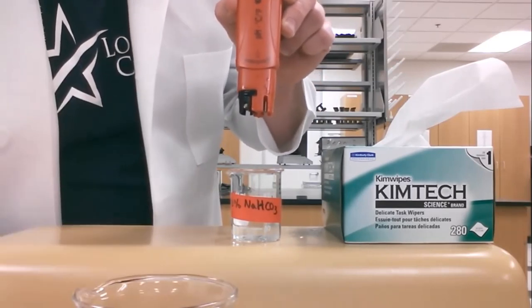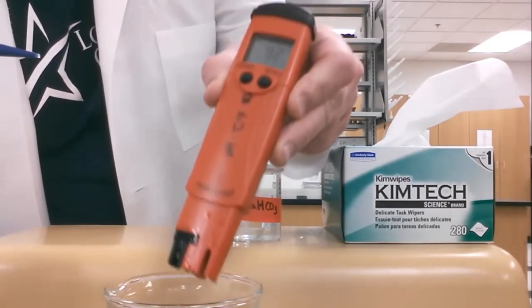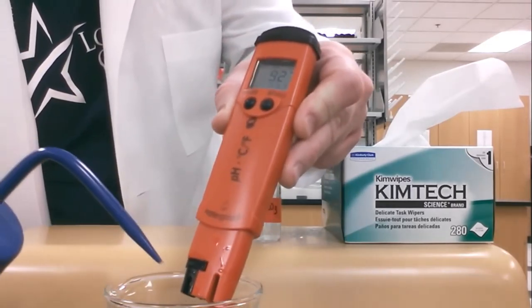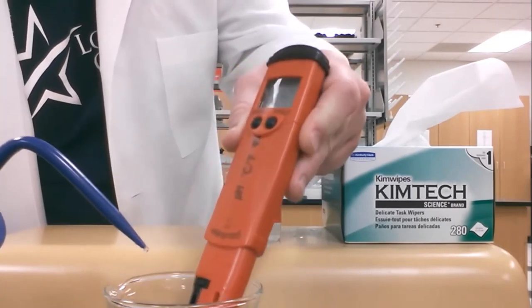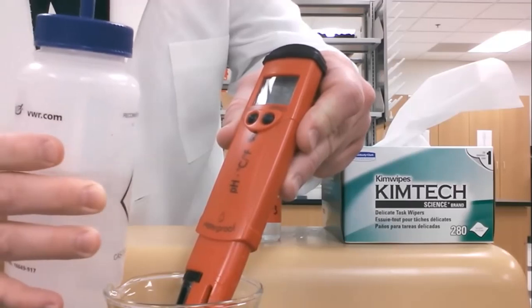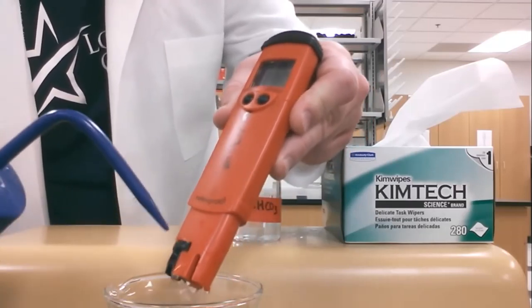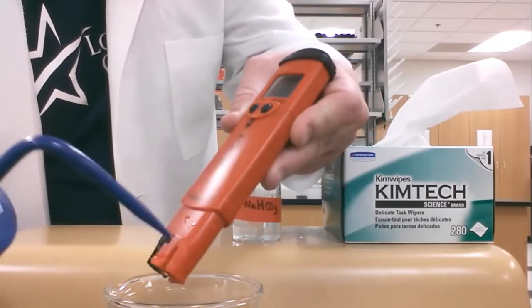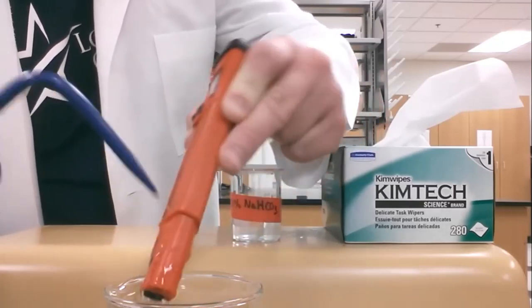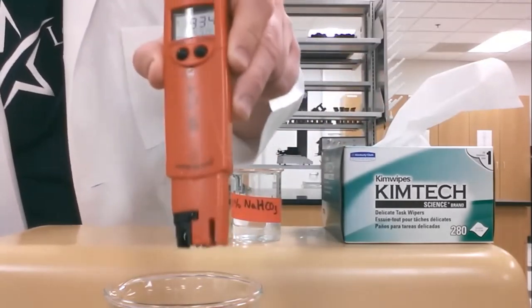Here I have a larger beaker that I'm going to use to rinse the pH electrode with. So I'm going to hold the electrode over the larger beaker. You can hold it over your sink if you want to. And I'm going to use DI water that's at your table, and I'm going to rinse the electrode. You got to get in there really good and rinse all around, everywhere where you had that solution. Give it a nice shake.